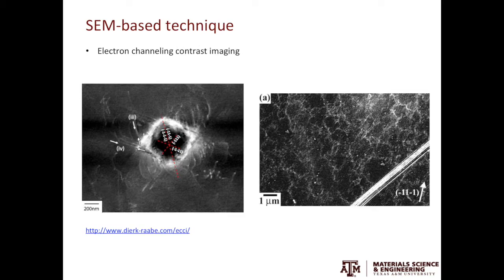In the example on the left, the ECI image shows the indent on the material and dislocations emanating from the indent. In the example on the right, I believe it's a heavily deformed metal and you can see those dislocation cell structures.